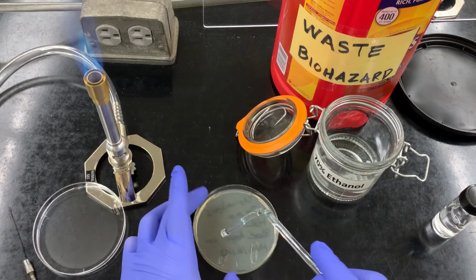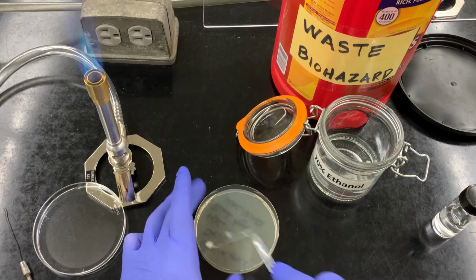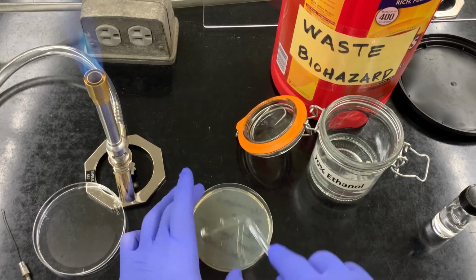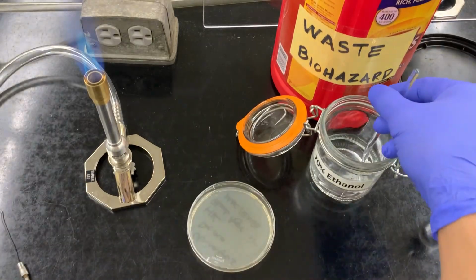And then remember, counterclockwise turn, clockwise with my spreader. 10 microliters is a very small amount, so this will probably take about 10 to 15 seconds. And we are done. Close the lid, put this away.